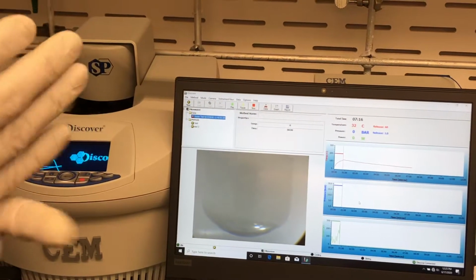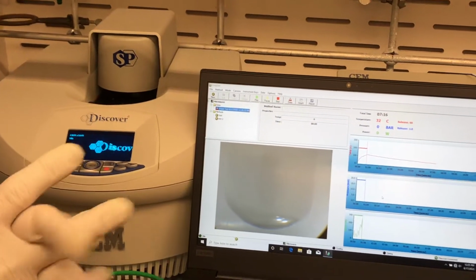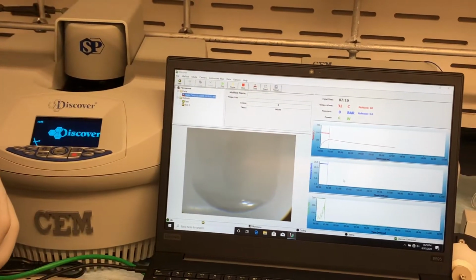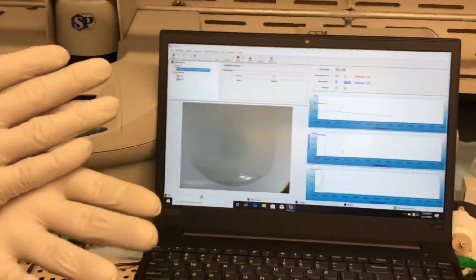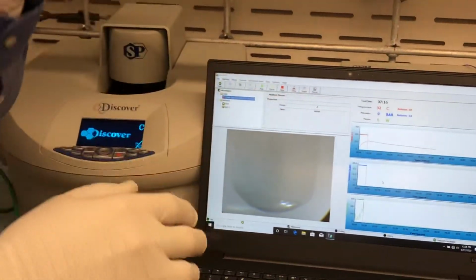Good question. Excellent. That's pretty much it on the basic operation of the system. From there, I can go over the gas addition, but that might be separate. It's a bit more niche, I suppose. If we purchase it, we still need to know. No, absolutely. I was just saying I wasn't sure if you wanted to create a new video or something like that.